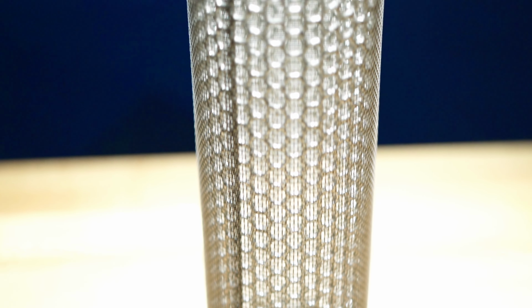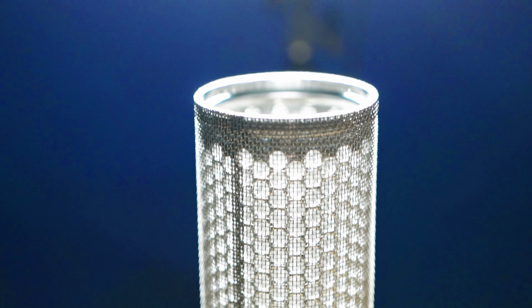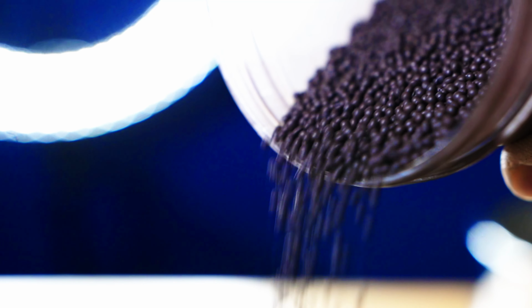There's many avenues to design woven wire mesh that screens the correct particle size range. One solution is to send the material to a wire mesh provider, like WS Tyler. To do this safely, you would need to submit the required SDS sheets for the material that's being tested, and the sample needs to be of a reasonable and testable size. If you're sending your material into WS Tyler, sample size minimums would be 50 grams for a Rotap, 10 grams for a CPA, and 20 grams for the E200LS Alpine unit.